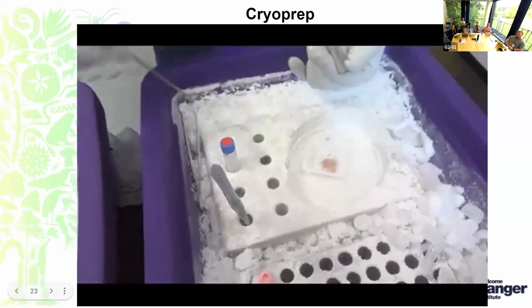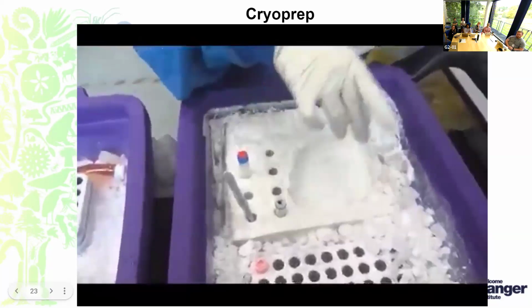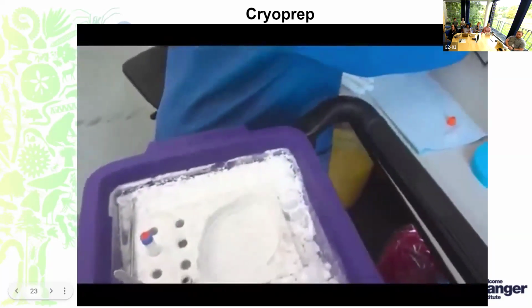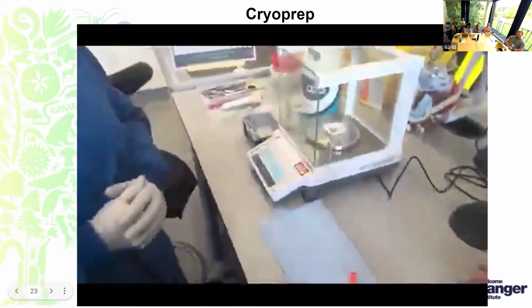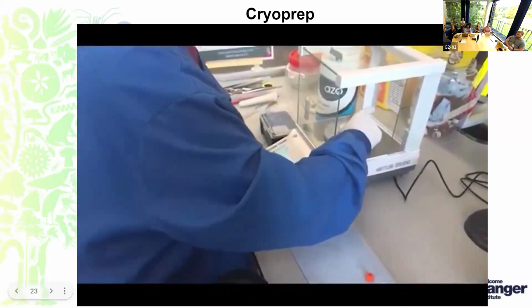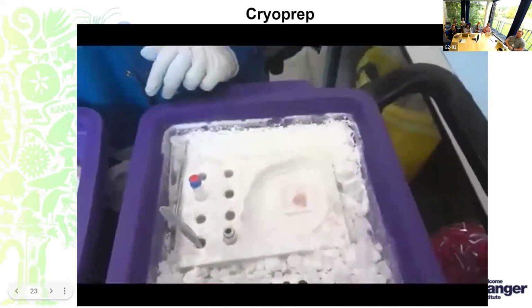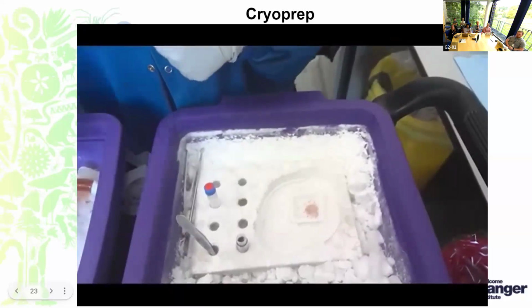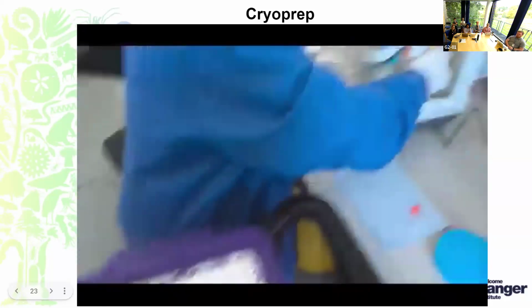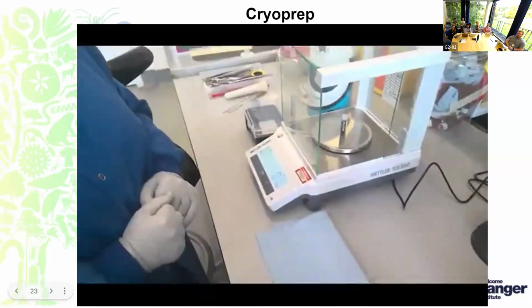While prepping samples for cryoprepping, we ensure we add extra tissue material so that we don't lose much during the transferring bit. This gets avoided in bead beating because the tissue material stays within the tube and is disrupted within the tube. Whereas in cryoprepping, we do lose samples in the cryo bags, but we ensure we balance that out while prepping the sample for this process.